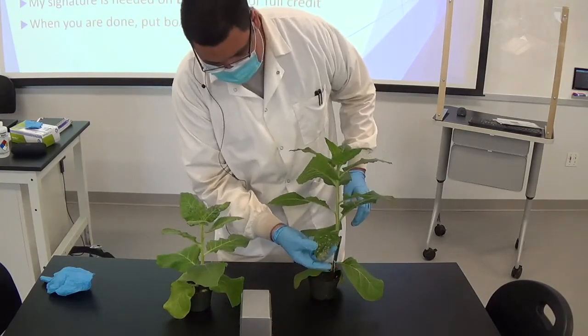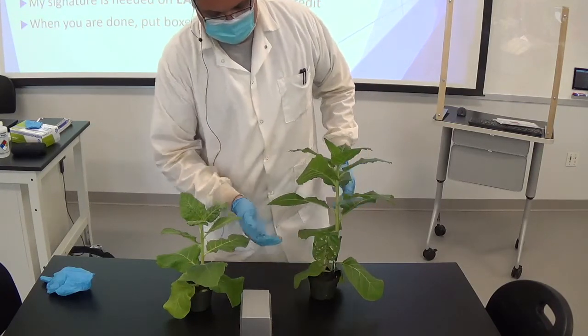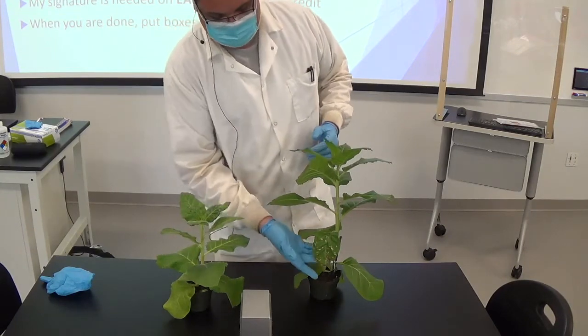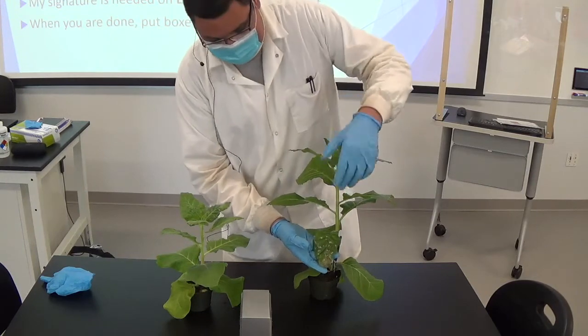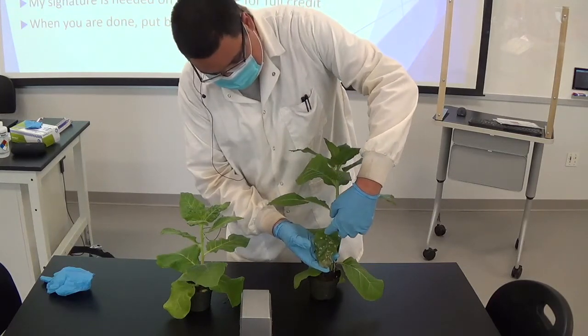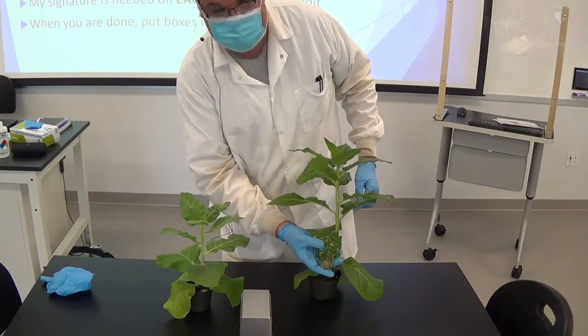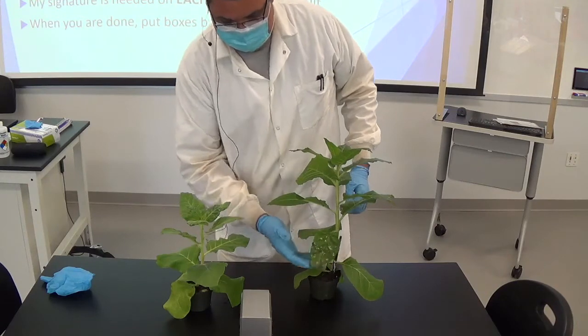Some of the parts of the plant over here look black compared to these white spots. That's just because whoever inoculated this rubbed too hard with the carborundum, so they completely burst the cells, which is, I guess, a type of cell death. But it's a lot different than the programmed cell death. You see all these white-looking spots, which are different. The cells are still dead in those white-looking spots, but it's a different type of cell death.